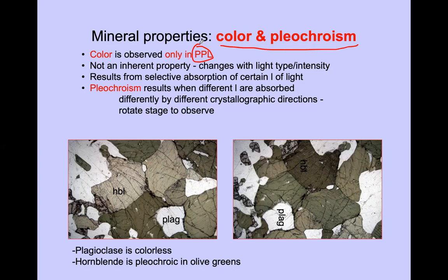That's why you get some vivid color, which is not the real color. Some of the minerals that you saw before in vivid, rainbow colors have a natural color like this, right? This is hornblende, for example. This is the natural color, observable only under plane polarized light.